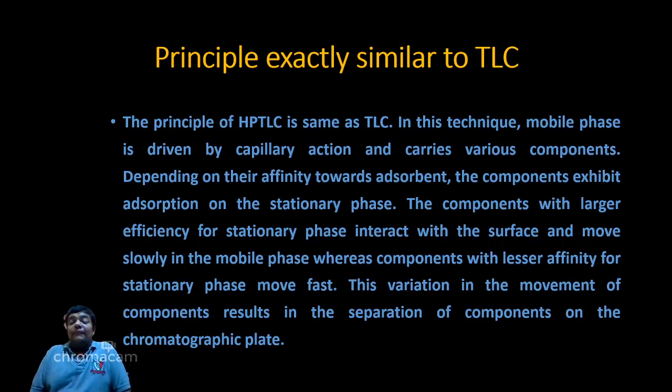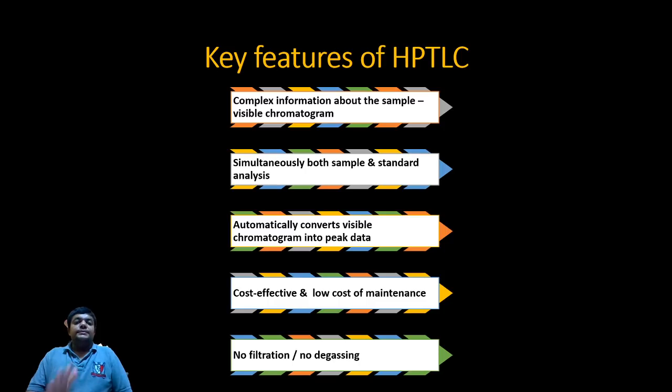It is given in a few references. So there is no more explanation needed for the principle on which separation occurs. We are very much versed with the adsorption as well as the partition phenomena as principles in various chromatography techniques. What are the key features of HPTLC?